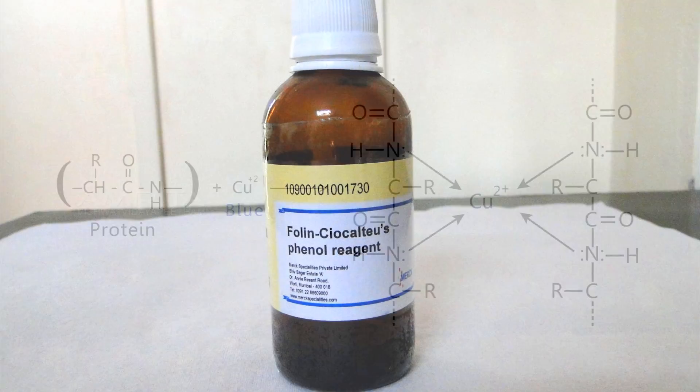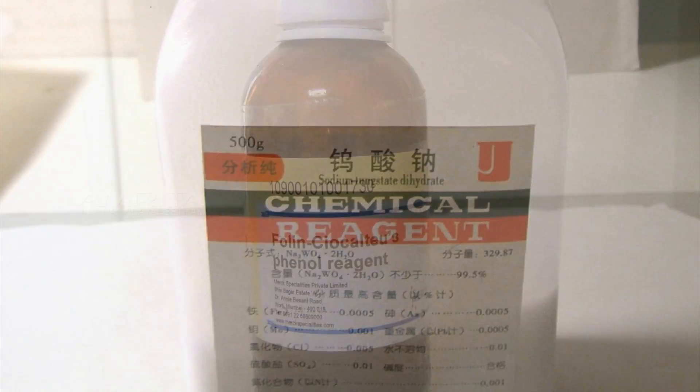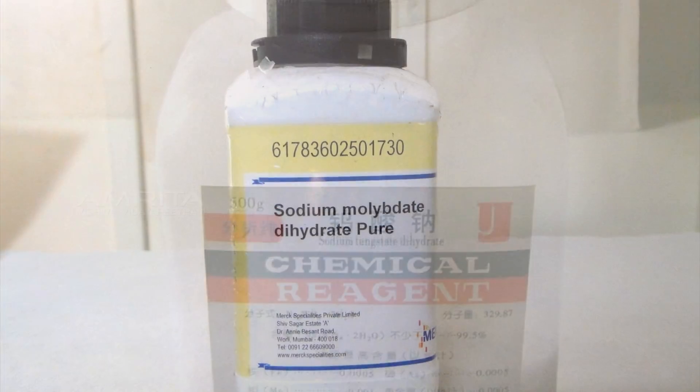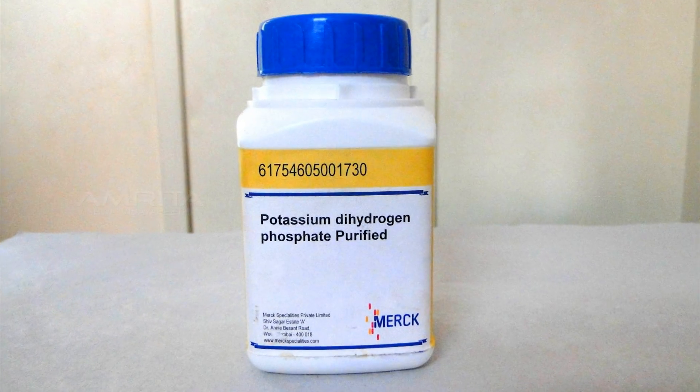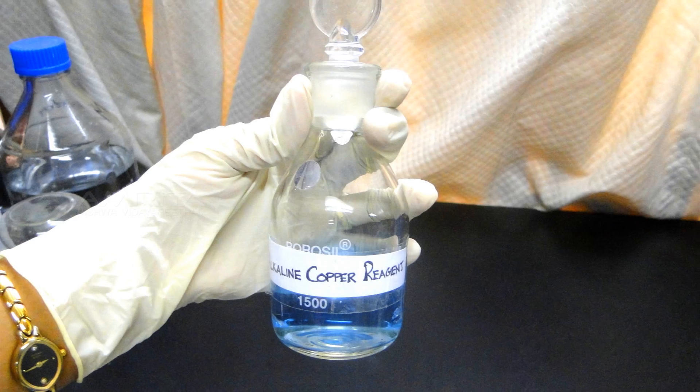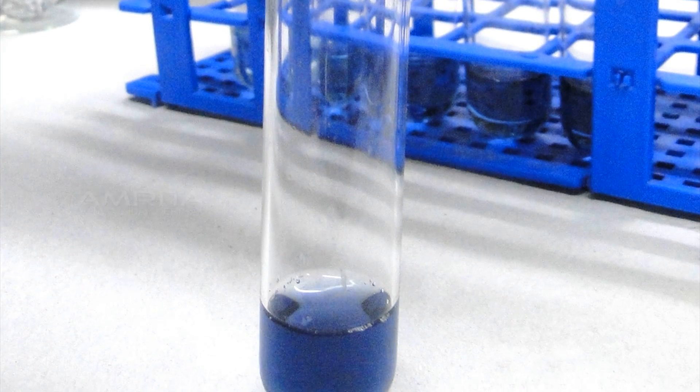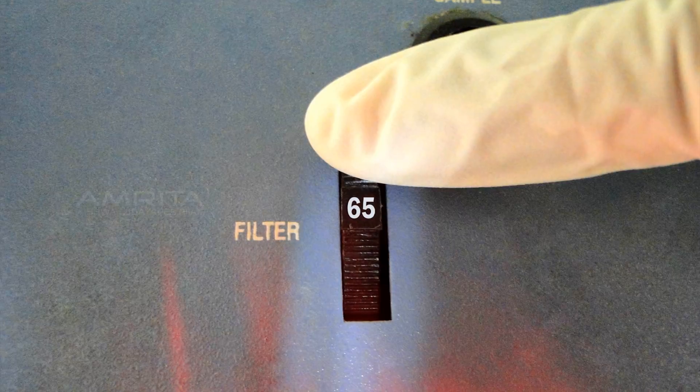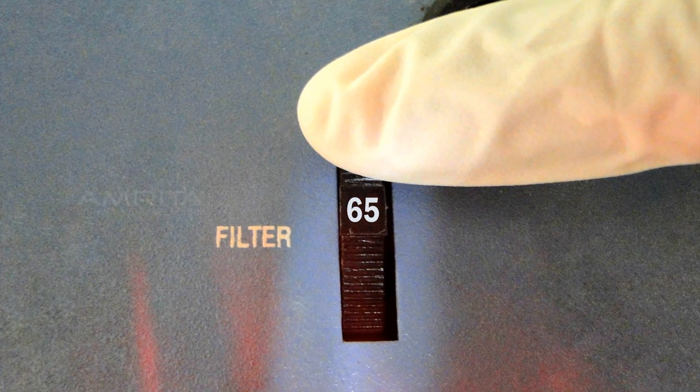Lowry reaction in which the Folin Ciocalteu reagent, which is a mixture of sodium tungstate, sodium molybdate, and phosphate along with the copper sulfate solution. When mixed with the protein, a blue-purple color is produced which can be assessed by measuring the absorbance at 650-700 nm.